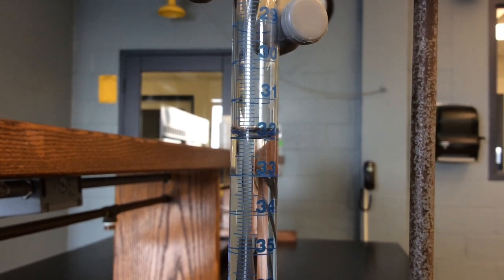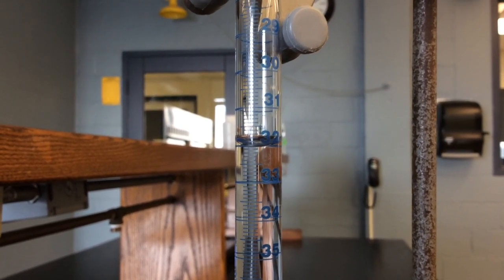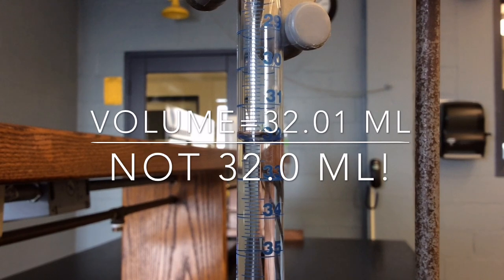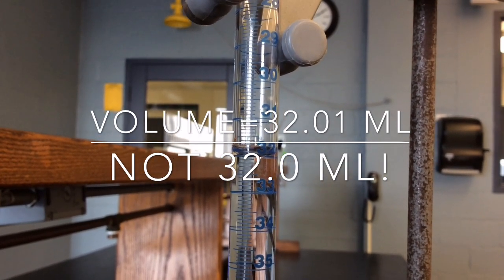With the beaker and the graduated cylinder, students often want to record with too many decimal places, while with the burette, students often want to record with too few decimal places. It is incorrect to record this volume as 32.0 milliliters. You must record with 2 decimal places.